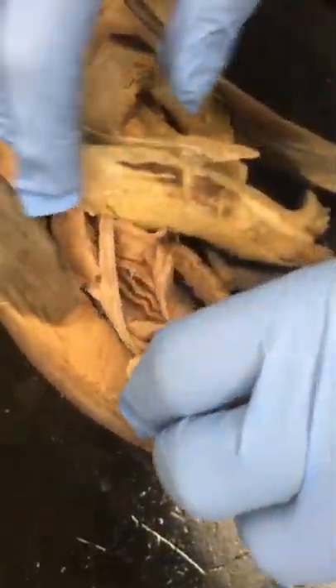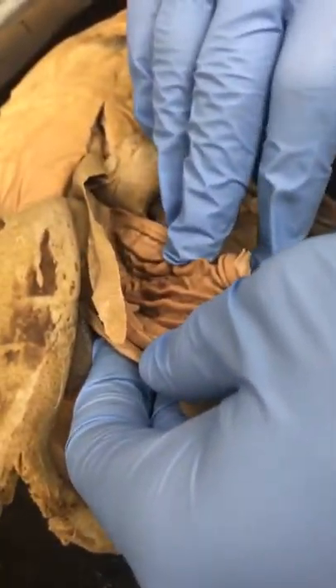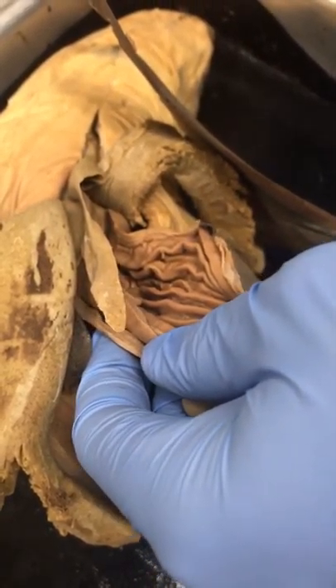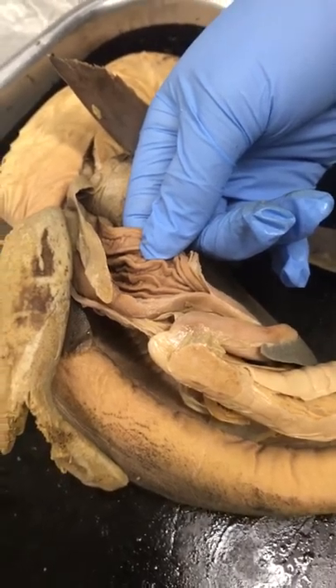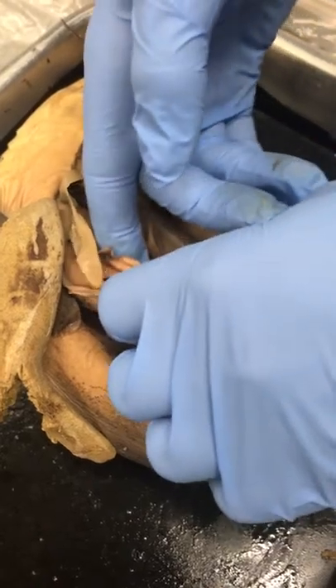The spiral valve just increases the surface area. If you look in here, it's kind of a folded area that increases the surface area for nutrient absorption. You can find that inside the intestines.